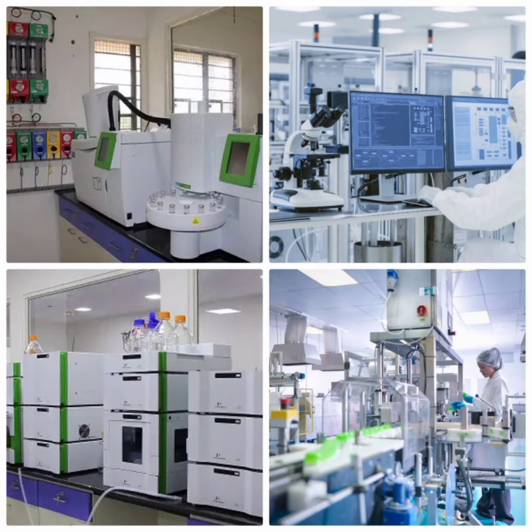Many chemical compounds, including drugs and metabolites, can be analyzed either by gas chromatography (GC) or high-performance liquid chromatography (HPLC), because both techniques function under the same basic principles of compound separation, identification, and quantification.